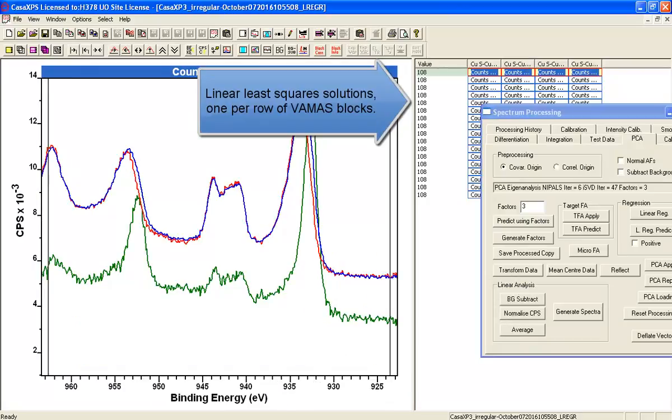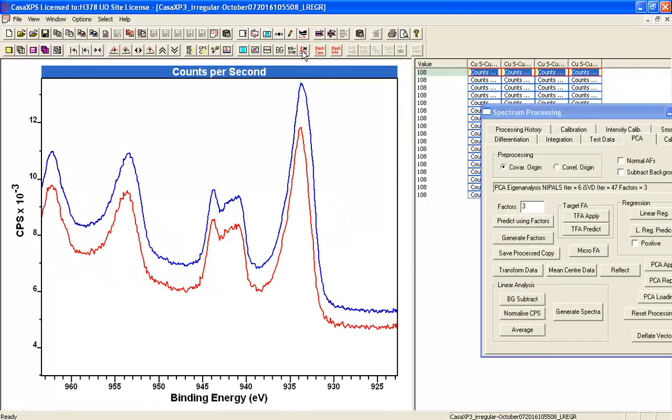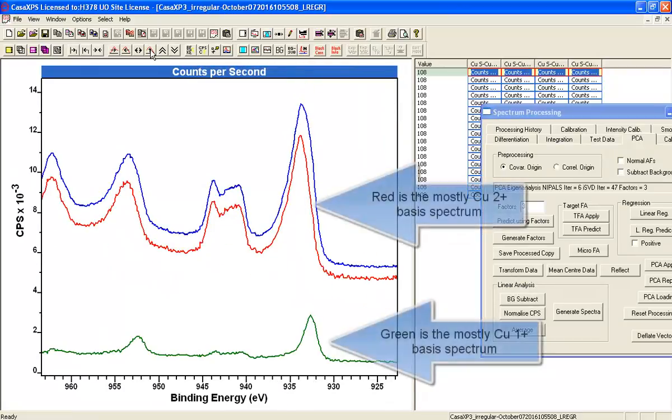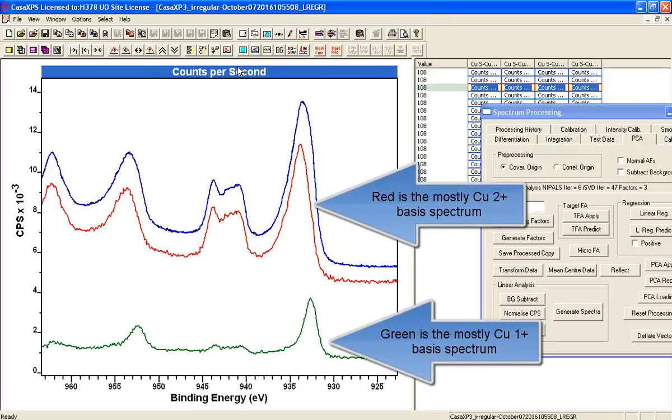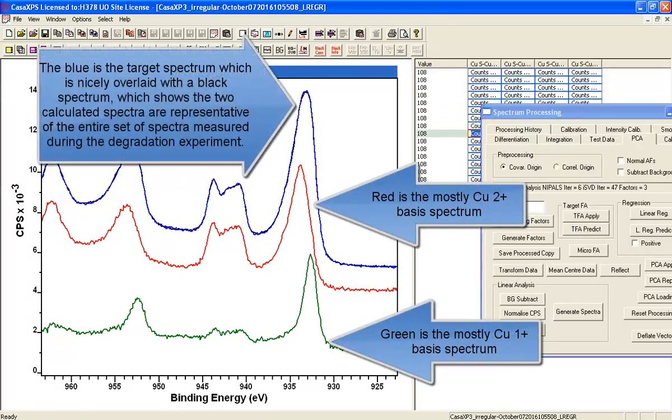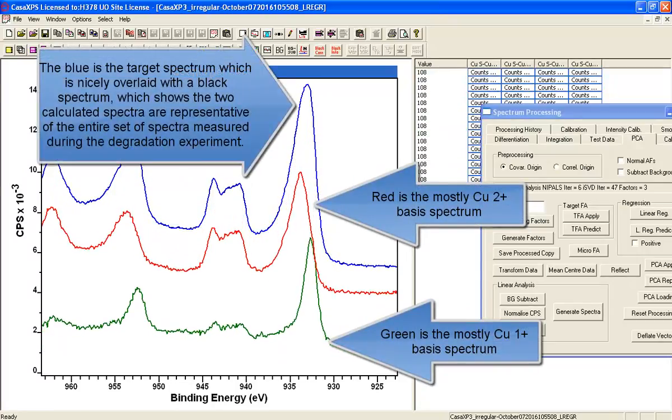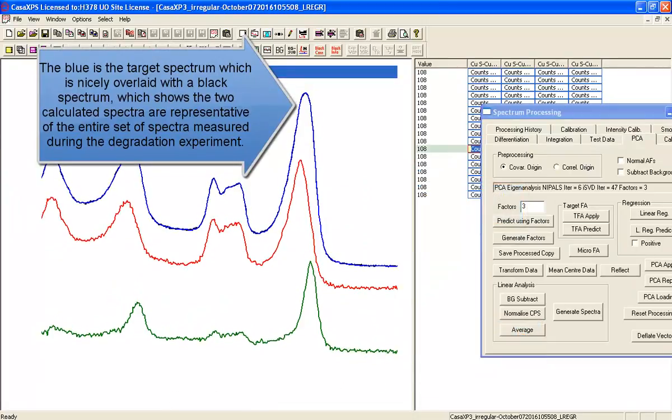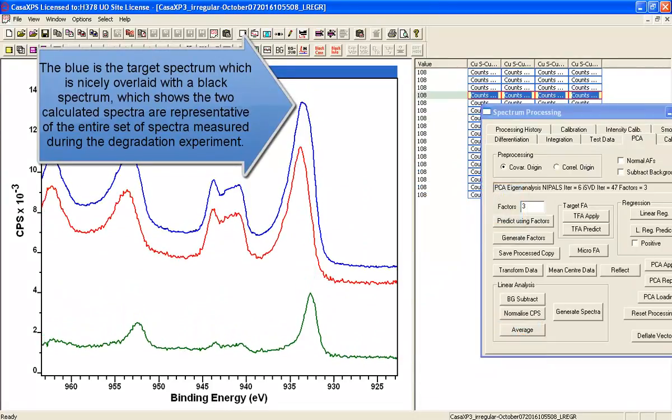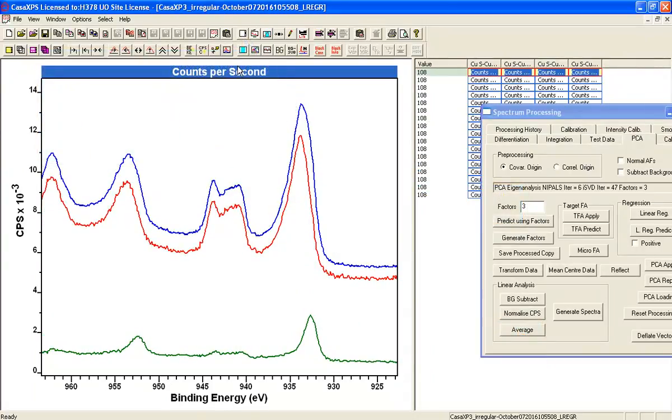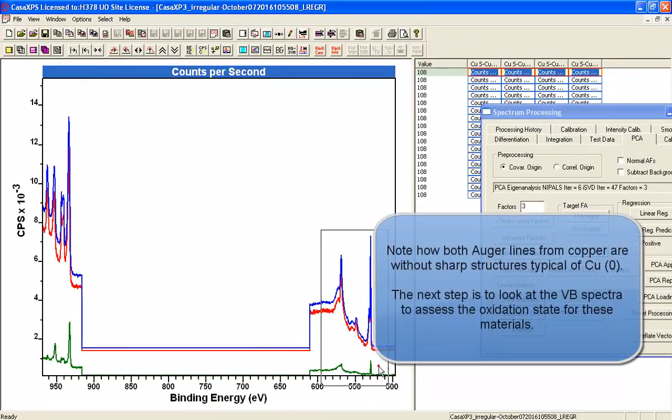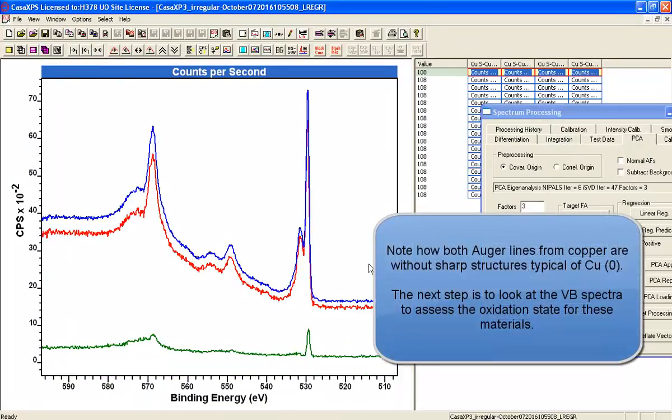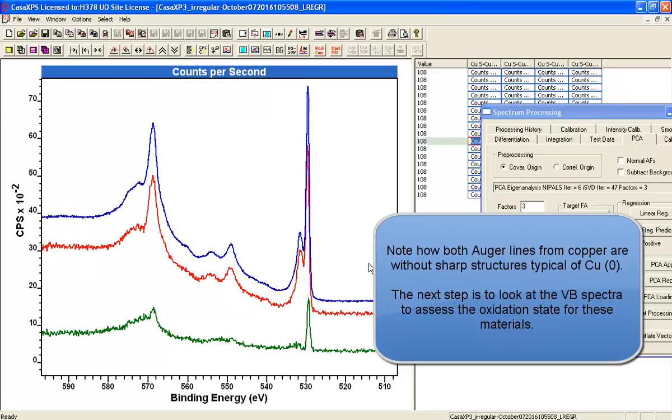So as we now examine these, just turn off the normalization and let's see what they look like. The red and the green are the two calculated line shapes. And as we adjust them, you can see that they are reproducing quite nicely the dataset as a whole. So we now need to do a little bit more investigation of what these two shapes might actually mean.